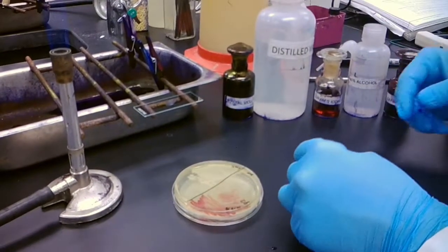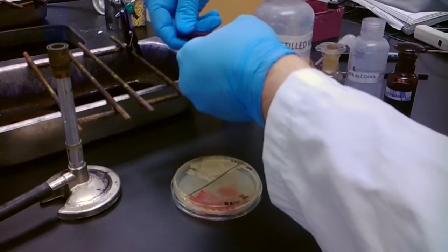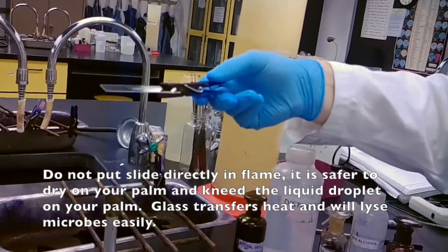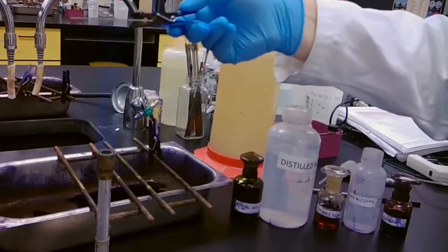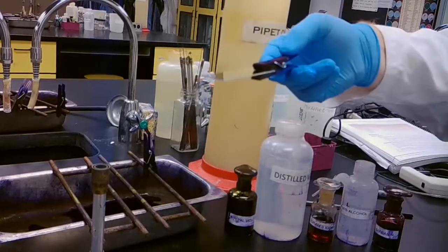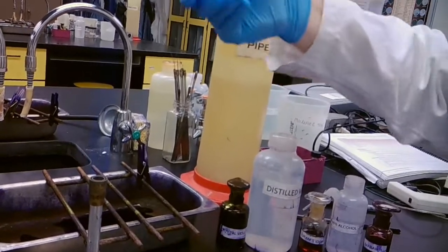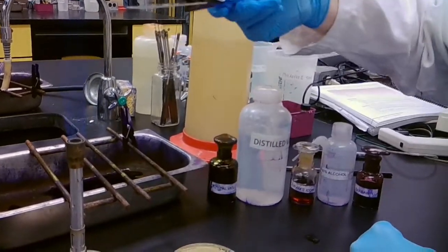So now what I'm going to do, as before, is dry off the slide by evaporating off the water. And again, make sure you do not put this directly into the flame. You can go a little bit above the flame, but don't keep it in the flame itself.